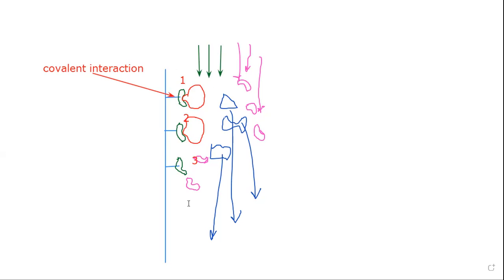Okay, so this is an equilibrium reaction where the molecules are not permanently bound to the ligand, but they can come off and they can again bind to the next molecule. So these interactions are happening very dynamically. Is that clear to you? Whereas any other molecule in the sample which is not specific will not be able to interact with any of these green colored ligands, and therefore they will come out of the column very rapidly.